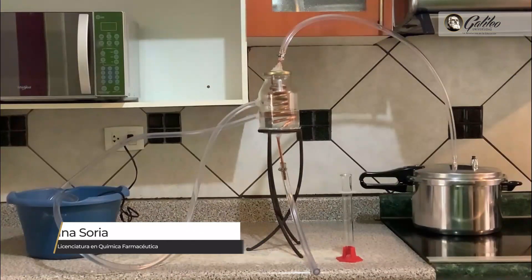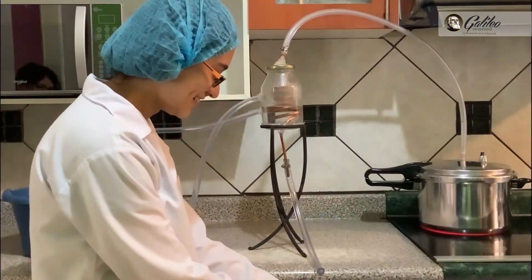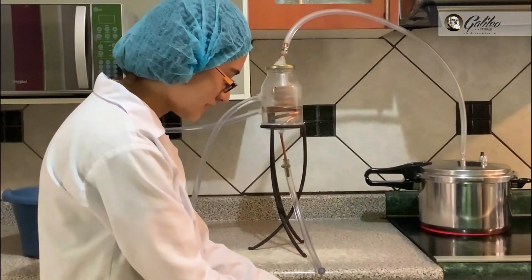Our project works in the following way. First, our mixture is put into the pressure cooker or coffee maker. We close it and connect the upper hose to where the vapors exit. In the case of the pressure cooker, that would be the valve. In this way, the vapors can be transported throughout the hose.